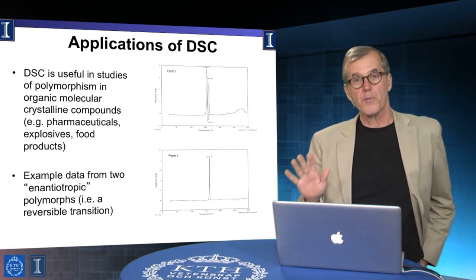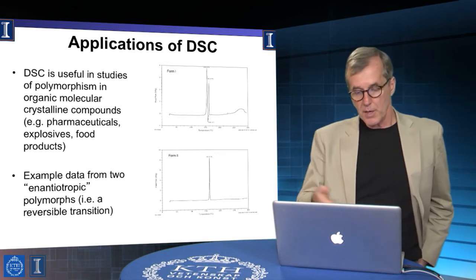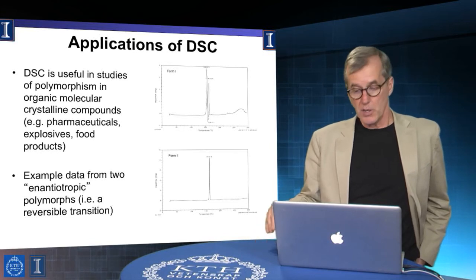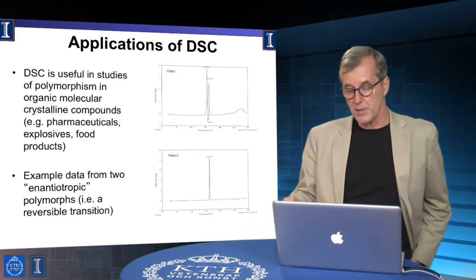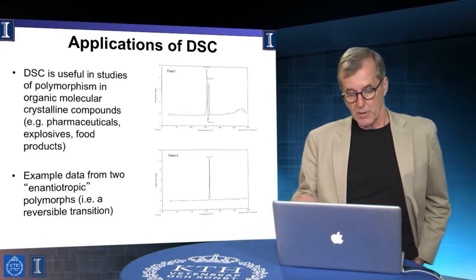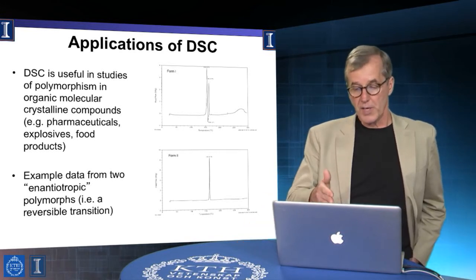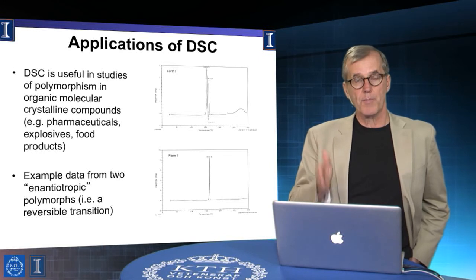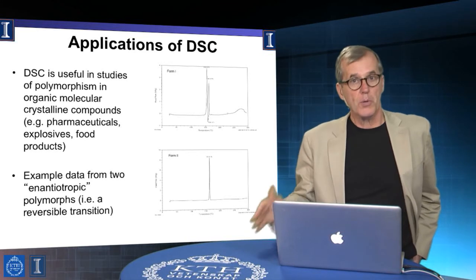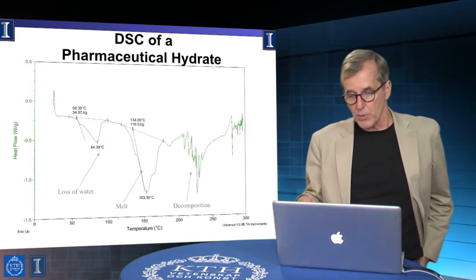That's a whole other form of art, and on very small sample sizes, I might add. Thermal measurements are frequently used to assess the states of materials, right? So that's not only a quality control mechanism; it could actually be an essential safety metric. For example, knowing that the particular form of a drug being administered actually corresponds to the therapeutically valid form of that drug. Okay. So, that's a really powerful example.